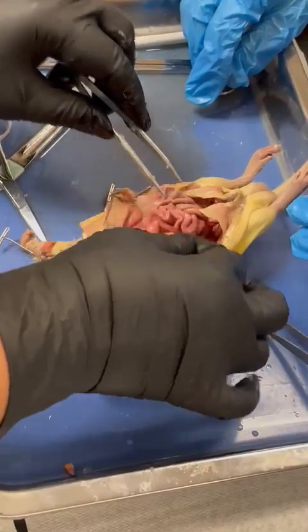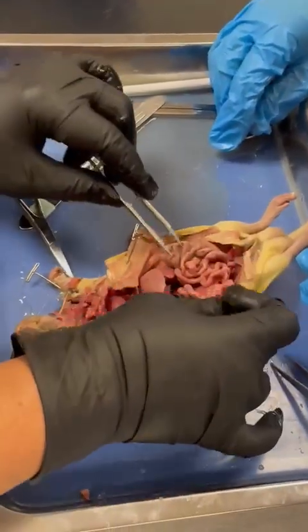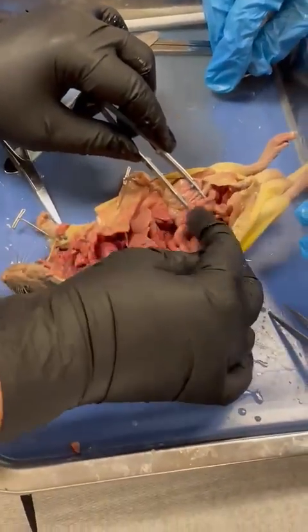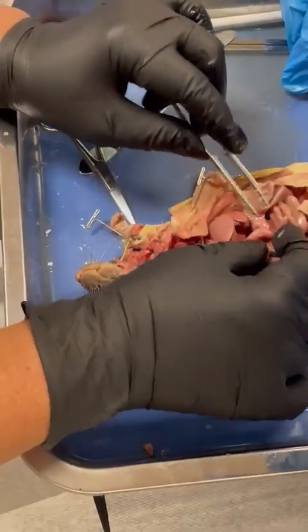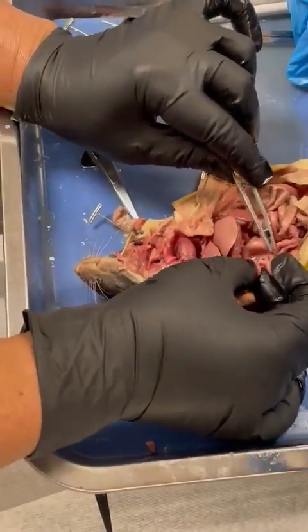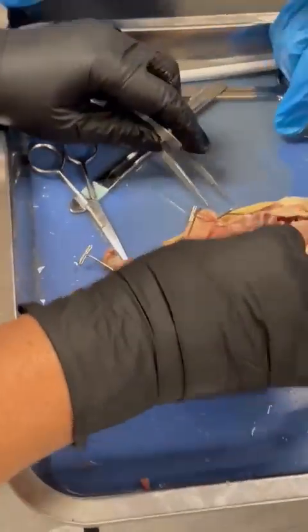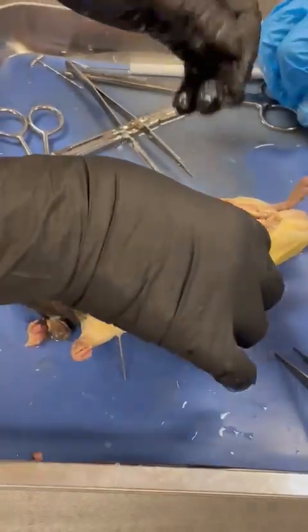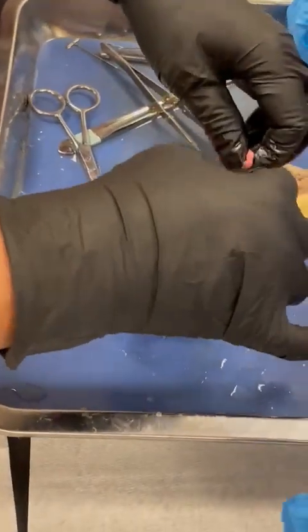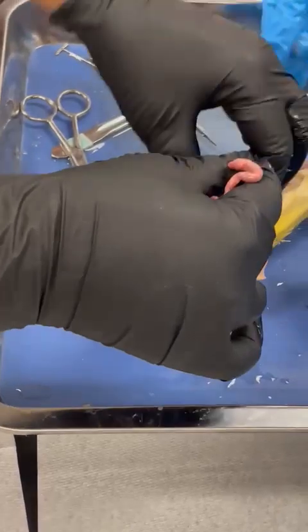The small intestine starts with the duodenum, jejunum, and ileum. It is all connected by connective tissue, which is highly vascularized. What is that clear, transparent membrane? That's the mesentery, the connective tissue which keeps the long tube from kinking and bending. So it keeps it all aligned. Right now I'm separating it, and there are lots of blood vessels.